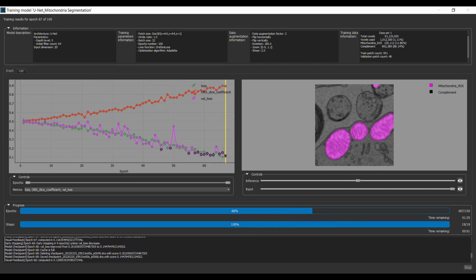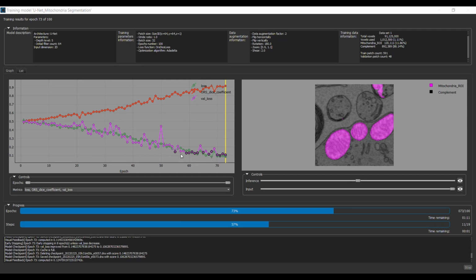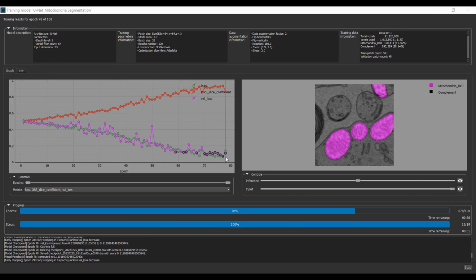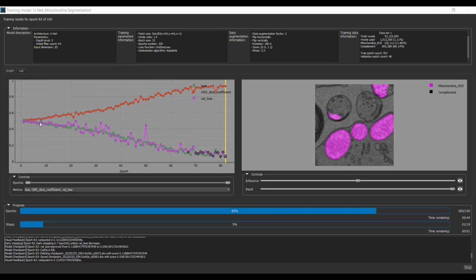As you see here, in some places there are thick circles, which means these are the saved checkpoints. The thick black circle is the saved checkpoint. Also you see a down-pointing triangle here, which means that's the lower value. This one is the lower, and the up-pointing triangle here on our validation loss is the higher value.